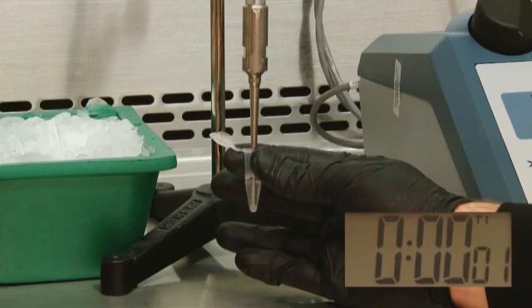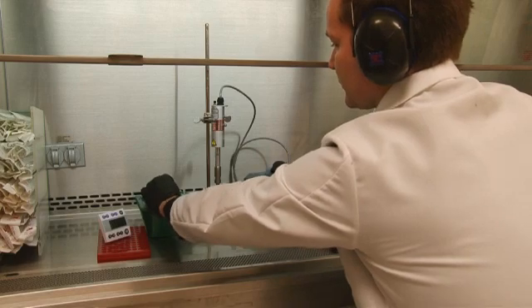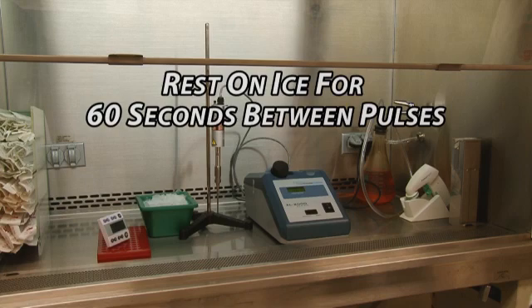For example, we find that six 15-second pulses at 50% power output works well for us. Placing the sample back on ice to rest for at least 60 seconds between pulses will cool the sample back down.